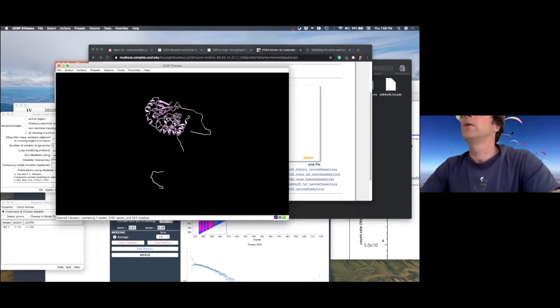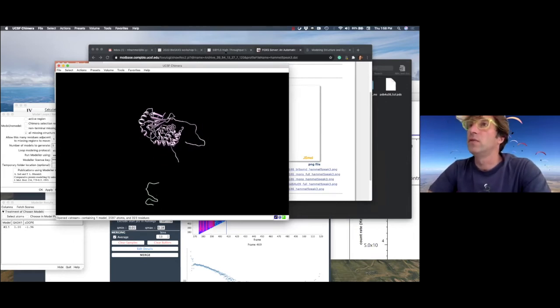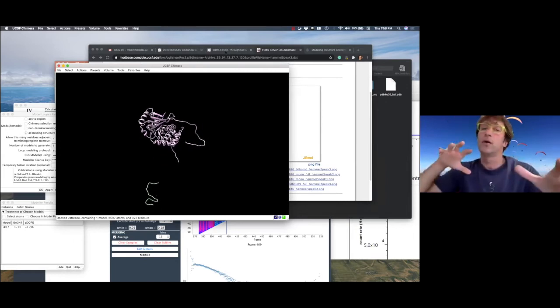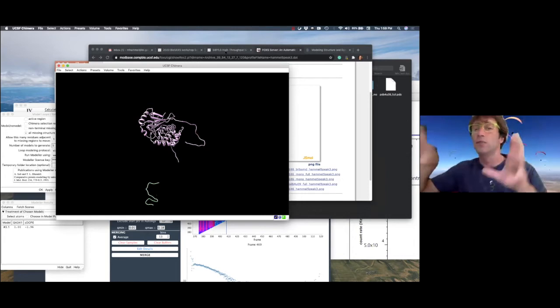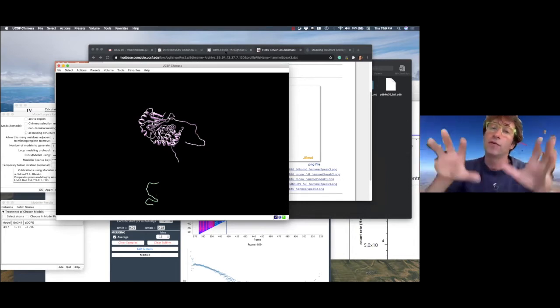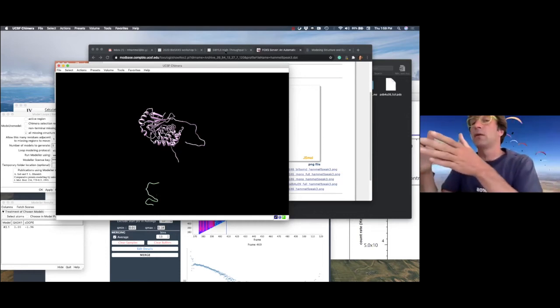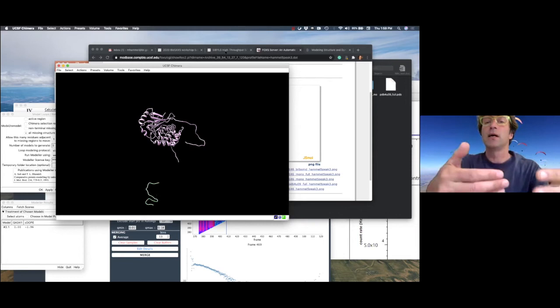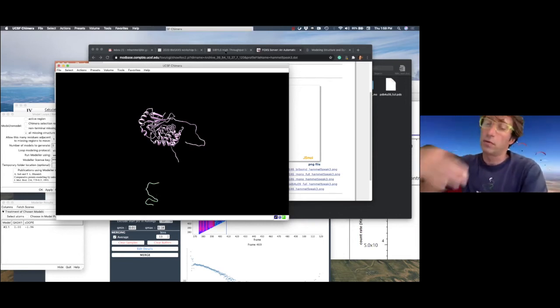And I will show it very briefly just for this case, which is very easy to use, and you can extend it to multi-conformational states or to beads-on-a-string structures where you move your domains around in a random way, and each conformer is matched and compared to our experimental data. And based on the goodness of fit, you select the best fit, or BILBOMD selects the best fit for you.